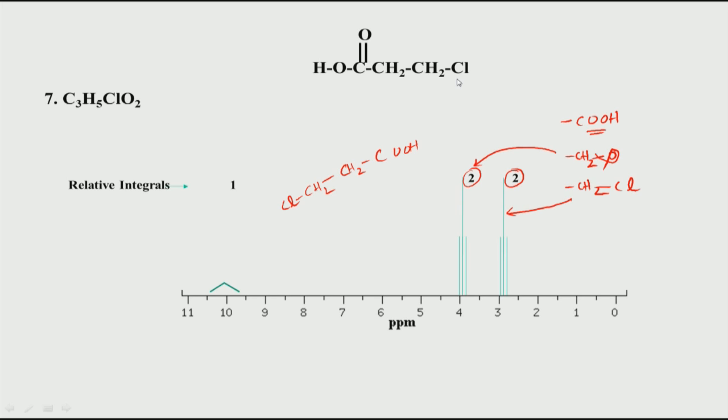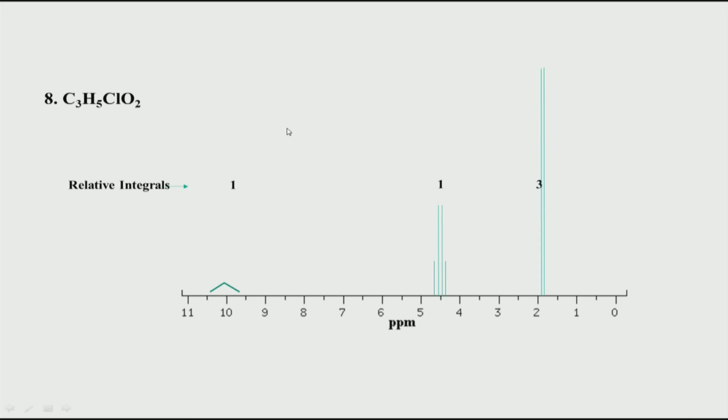or C attached to nitrogen, then you expect a downfield shift of this proton. But here it is attached to carbonyl, not directly to the oxygen, and carbonyl shifts not so much downfield as you expect from Cl. So, this is the structure matching with this spectrum. The main important point is that a peak is observed which corresponds to a carboxylate group. So, let us look at the next example.